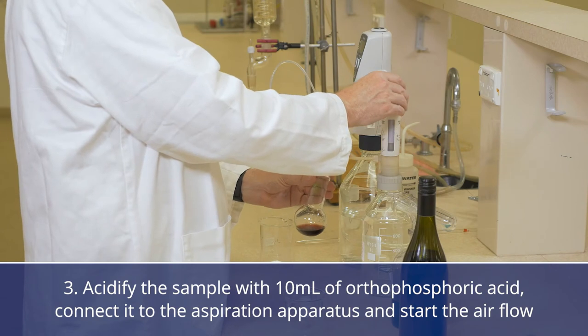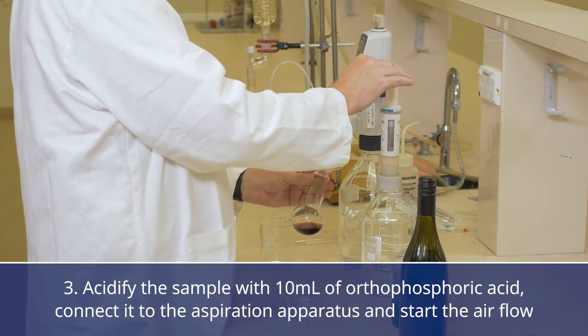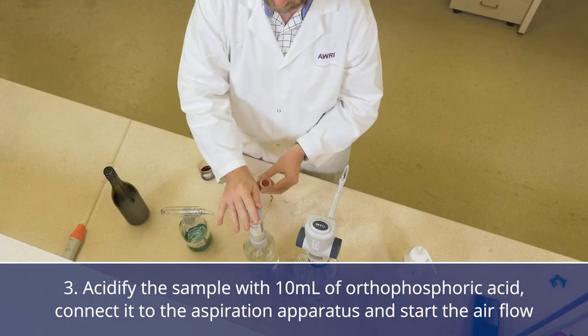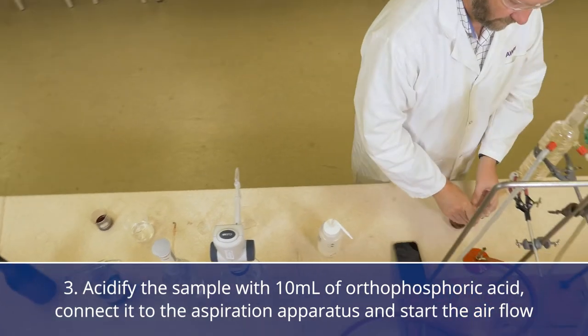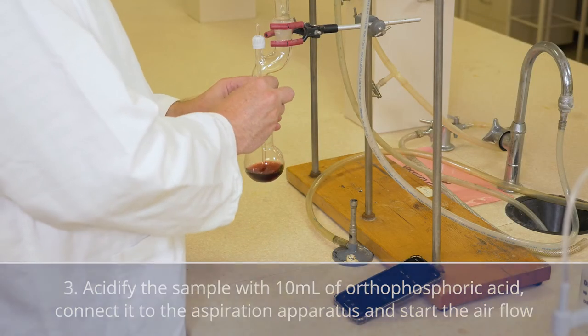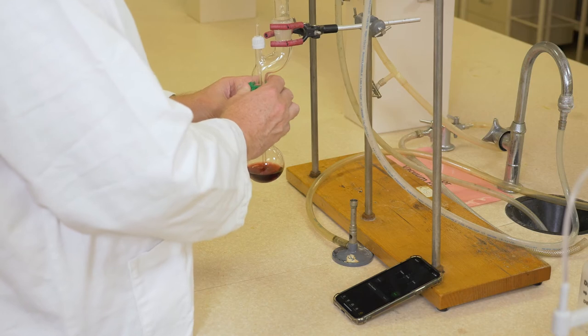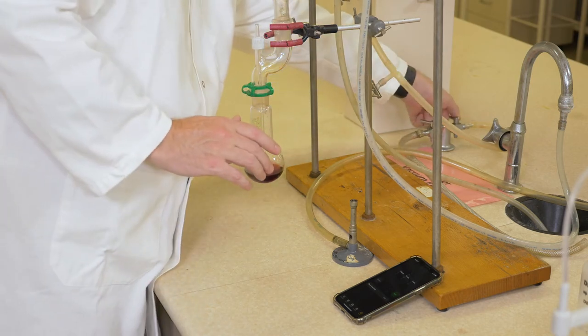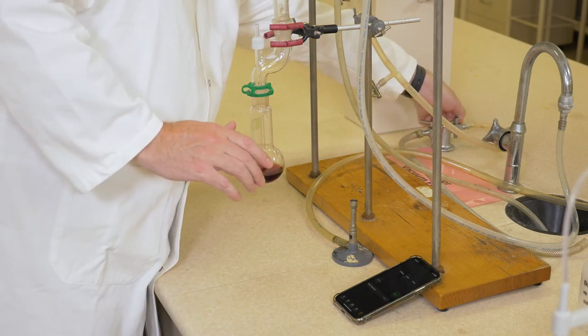Acidify the sample by adding 10 mL of orthophosphoric acid and immediately connect it to the aspiration apparatus and start the airflow. It is important to do this step as quickly as possible to avoid the loss of the volatile sulfur dioxide.